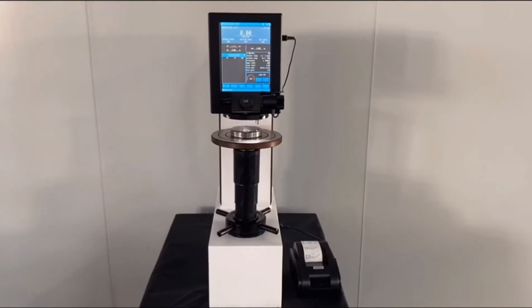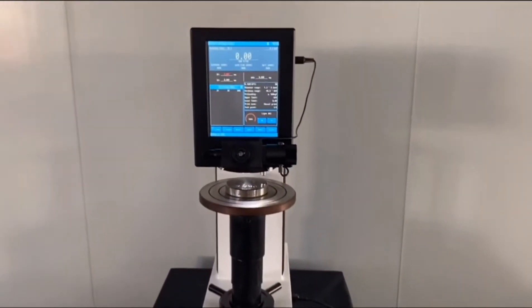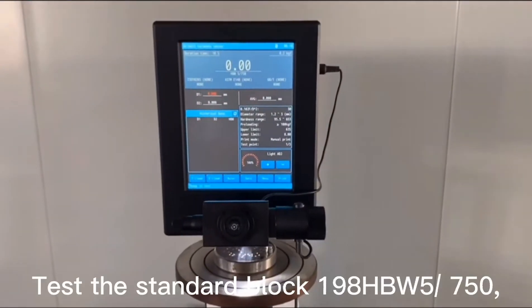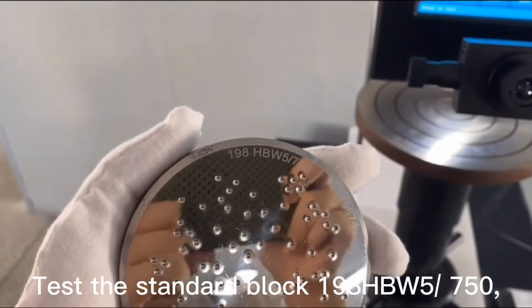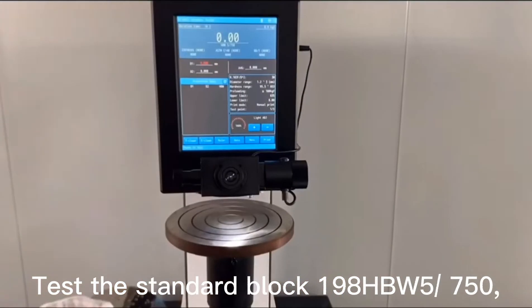Semi-Automatic Digital Brinell Hardness Tester. Test the standard block 198HBW5/750.